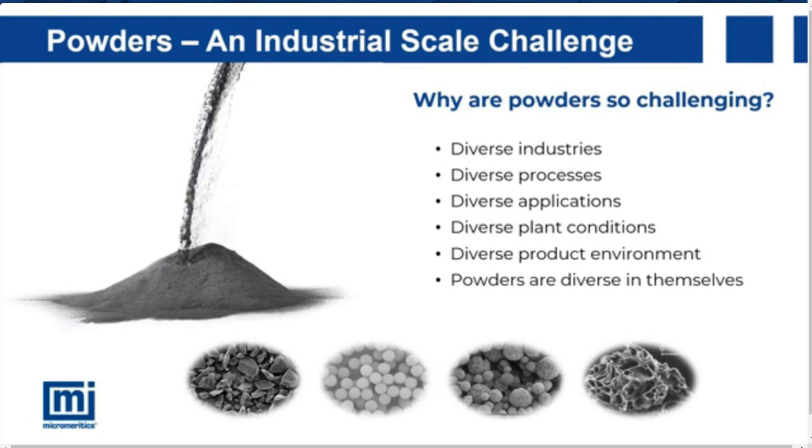We also need to consider the environment. What are the materials of our process equipment? What forces are we subjecting our powders to? And what physical and chemical changes are we imposing on them? Each of these factors ultimately affects how powder flows and the effects that flow has on process.